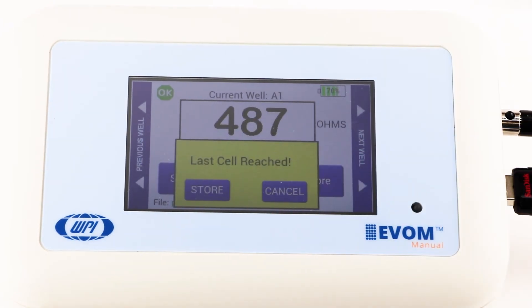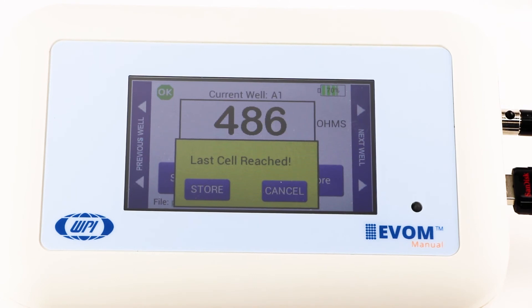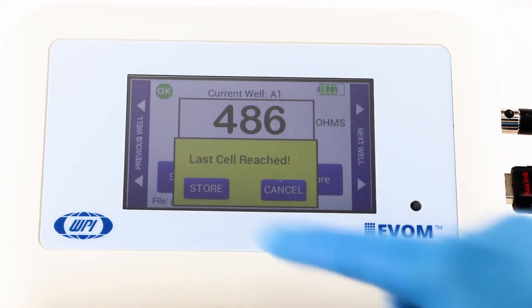Once the last well has been recorded, the file storing selection notification appears. Press store.